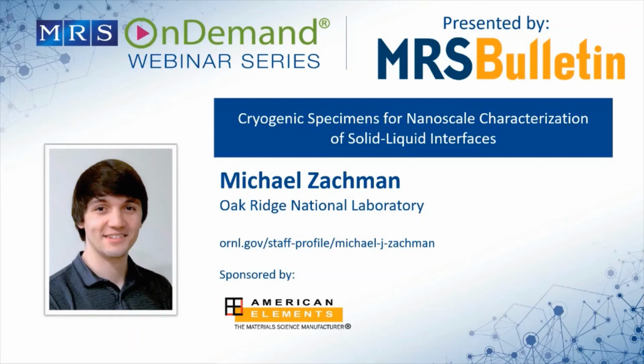Can I add there that there's actually a lot of effort from companies like Leica, and you mentioned Quorum, focused on that transfer step and keeping it completely under LN2 and away from ambient conditions. So that's very encouraging, I think, for the workflow that there are companies targeting that specific action. Yep, I think whoever gets a really good transfer first will probably benefit a lot from it, because I think that's one of the last things really. Yeah, as we were saying earlier, that's one of the areas where there's still room to improve the instrumentation to make that workflow much more reliable. Yep, I agree.